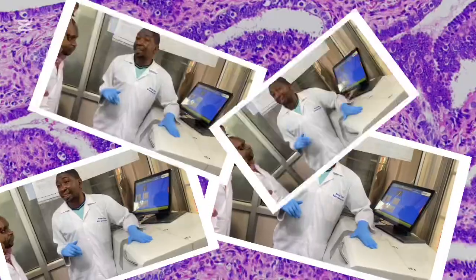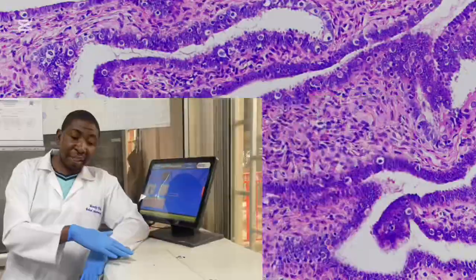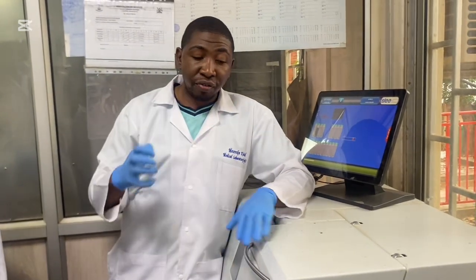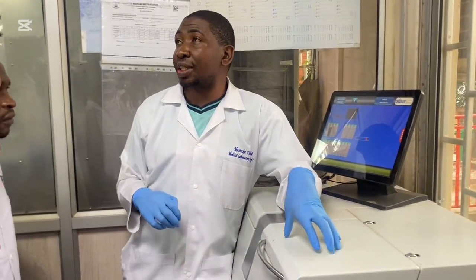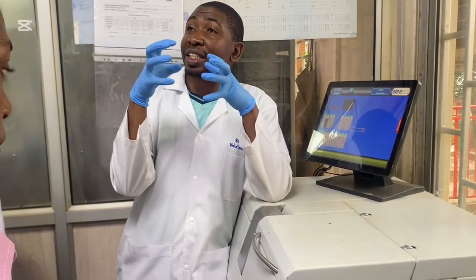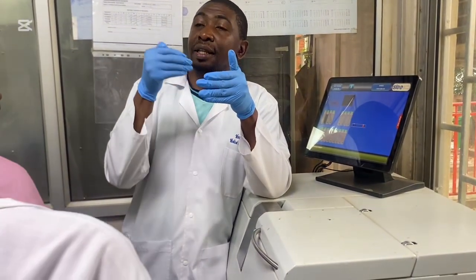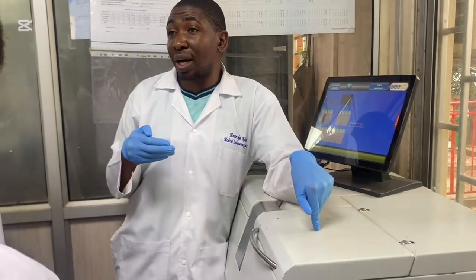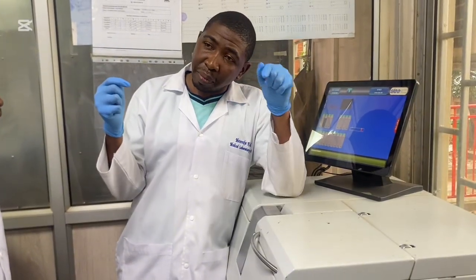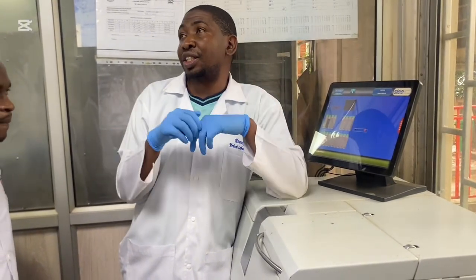The last aspect is the vacuum system, because we call it the vacuum type of tissue processor. The vacuum system is mostly applicable during infiltration. Vacuum helps us extract air from the processing chamber, because the presence of air will cause resistance to paraffin wax penetrating the tissue. So the presence of air slows the rate at which paraffin penetrates what? Tissue. So vacuum helps us remove air so that paraffin wax can penetrate the tissue.